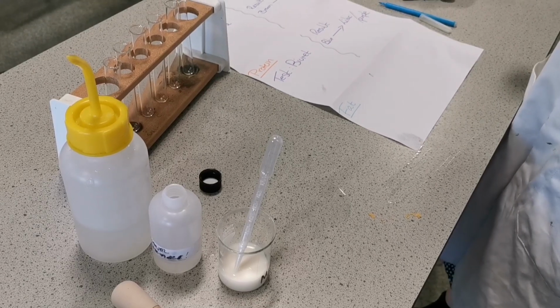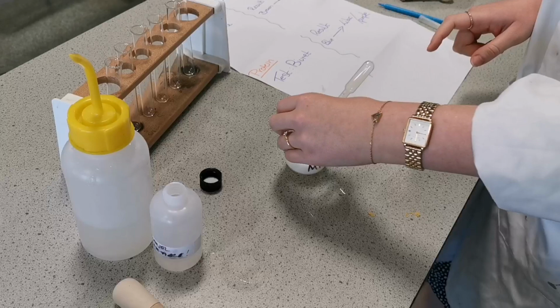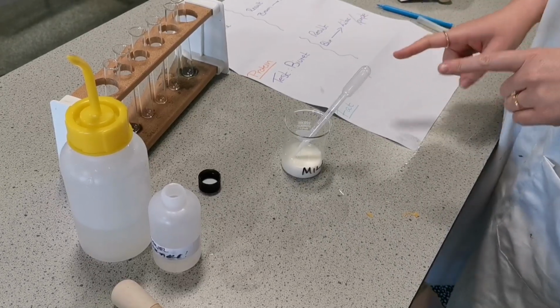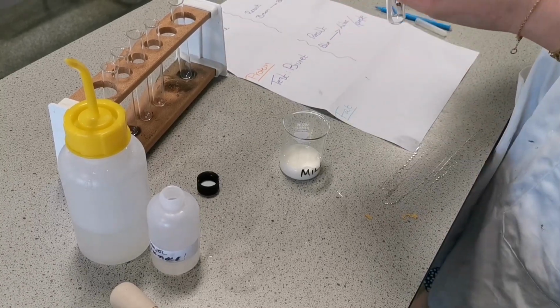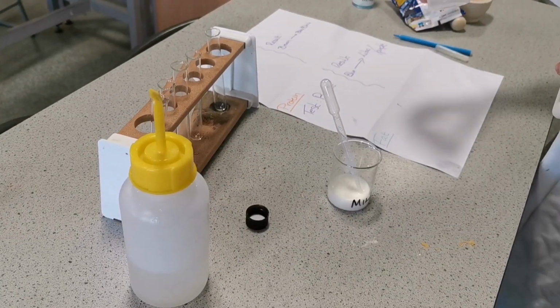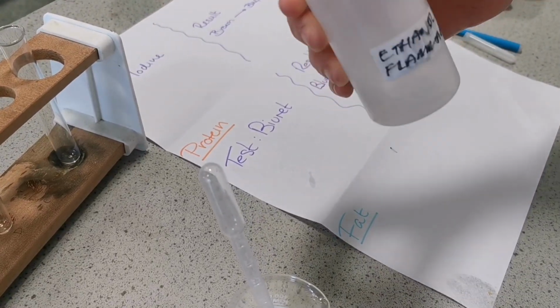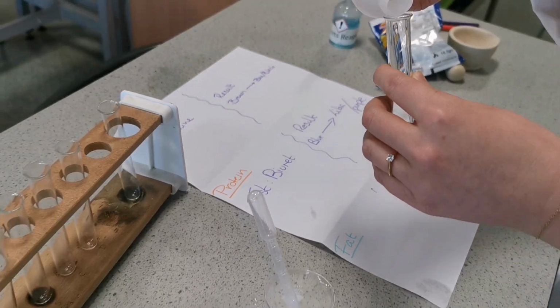Okay, the next test that we're going to do is the test for fat. To test this, we're going to use some milk, as we can probably assume that's got fat in it, but let's find out. To use the test for fat, you're going to put a little bit of your substance that you're going to test in a test tube. And the test for fat is to use ethanol. Now, ethanol is very, very flammable. You have to be careful with it. It is essentially an alcohol.